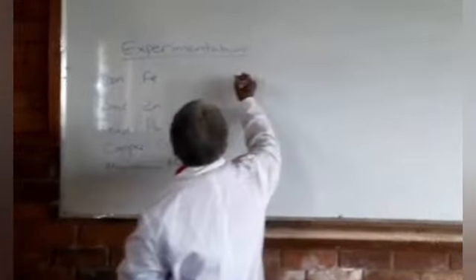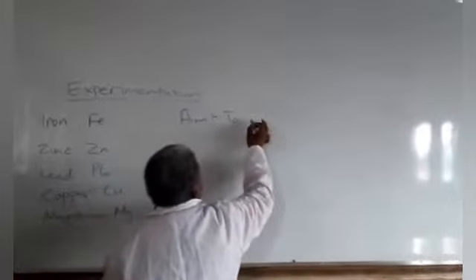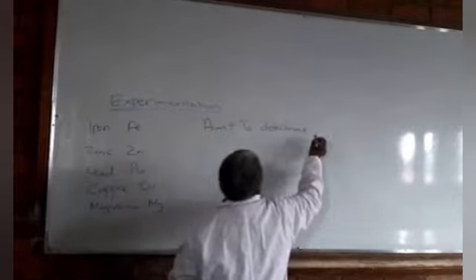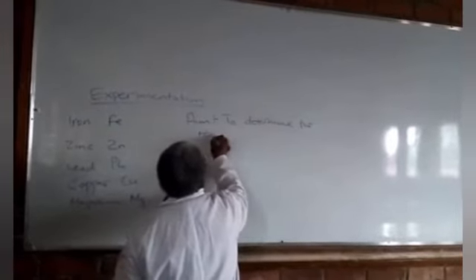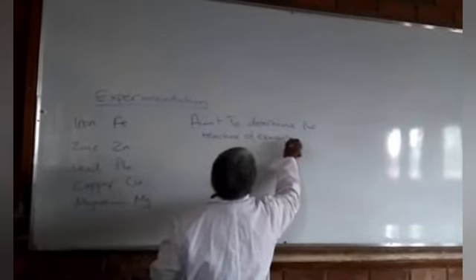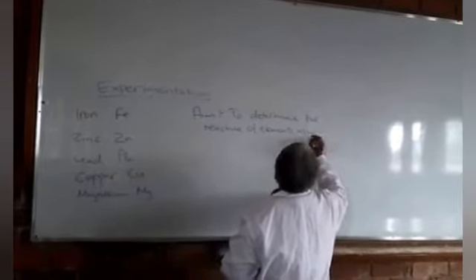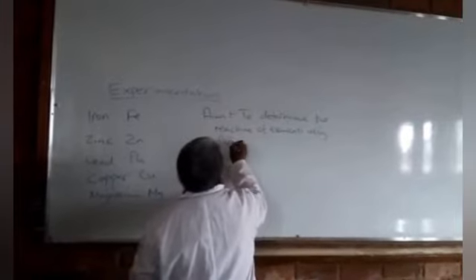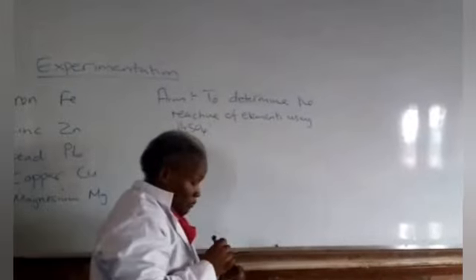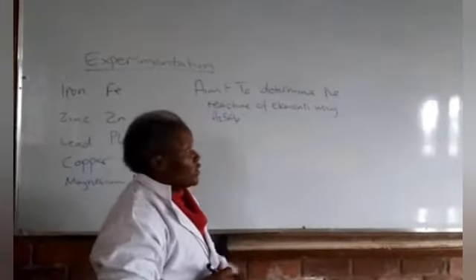Okay, so the aim: to determine the reactivity of elements using sulfuric acid. That's what we want to do. We want to determine the reactivity of some elements, and we are using their reactions with sulfuric acid. So this is our aim.